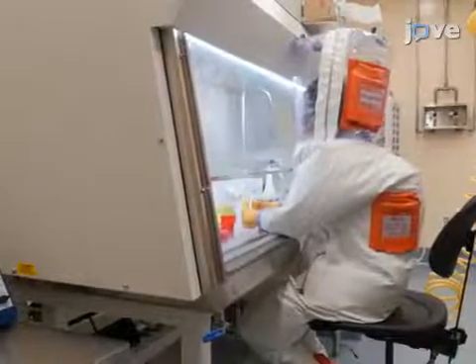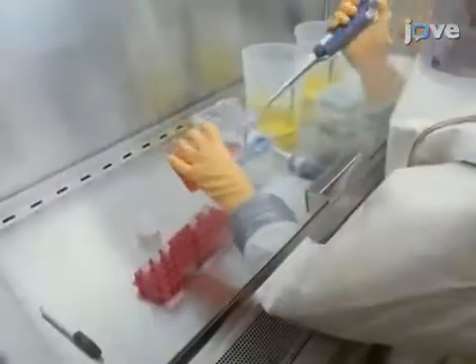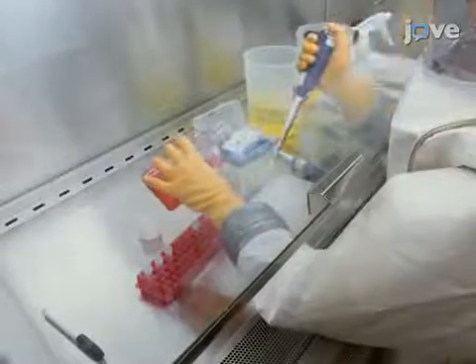Perform all work as close to the inside center of the class 2 biosafety cabinet as possible. The inside center is designed to be the most effective position to protect oneself.